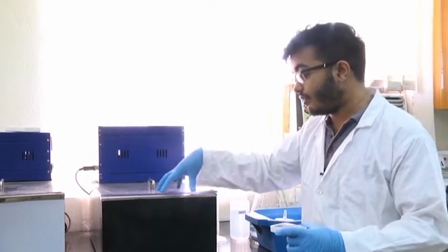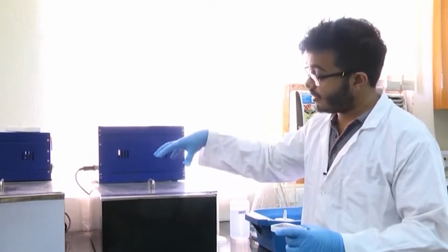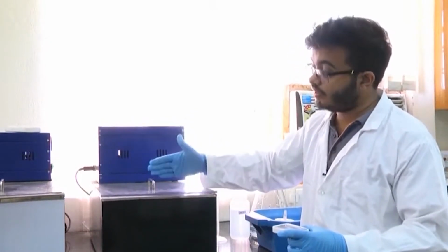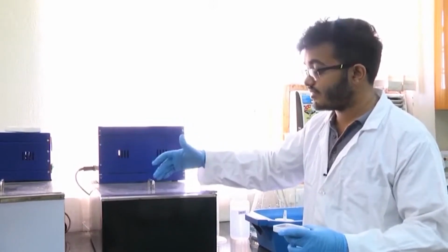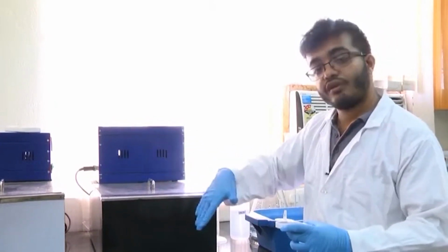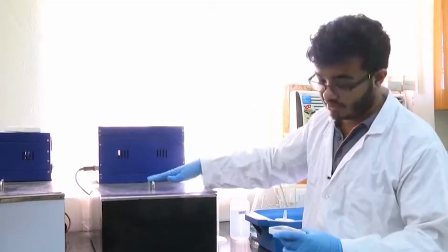So, my take on this point is, at 42 degrees centigrade, heat shock for 45 seconds. If it is at 40 degrees, then just go a bit longer, increase it by 15 seconds, so give a heat shock for maybe 1 minute. Do not go below 40 or 39 degrees centigrade, and do not go beyond 42 degrees centigrade.